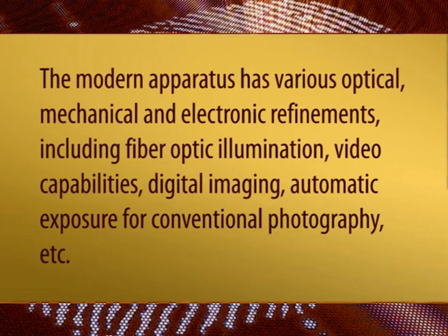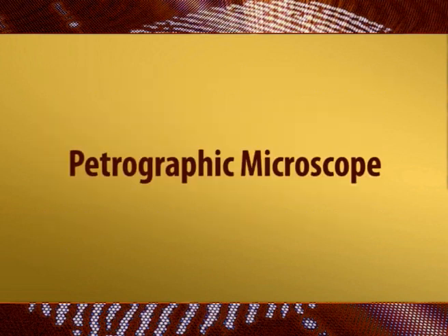The modern apparatus has various optical, mechanical and electronic refinements including fiber optic illumination, video capabilities, digital imaging, automatic exposure for conventional photography, etc. Then you have the petrographic microscope.